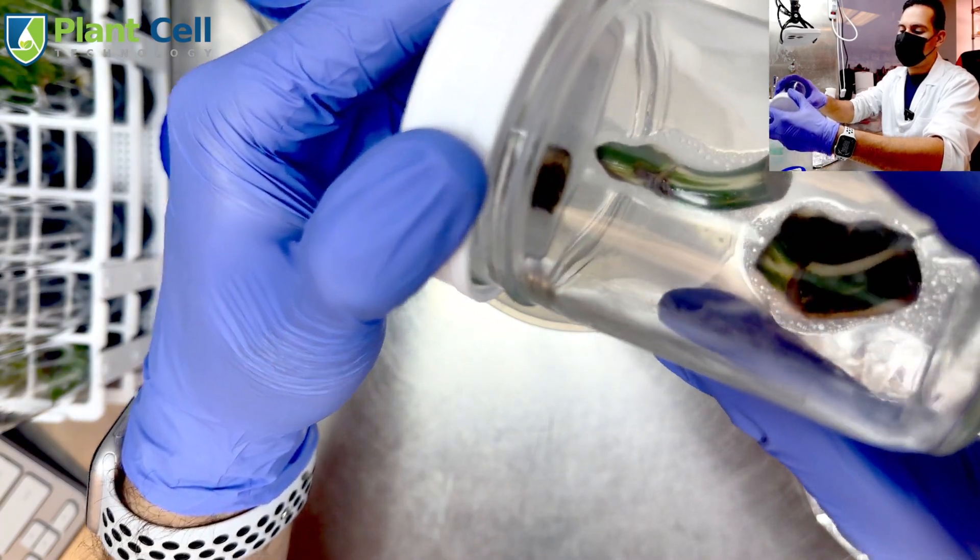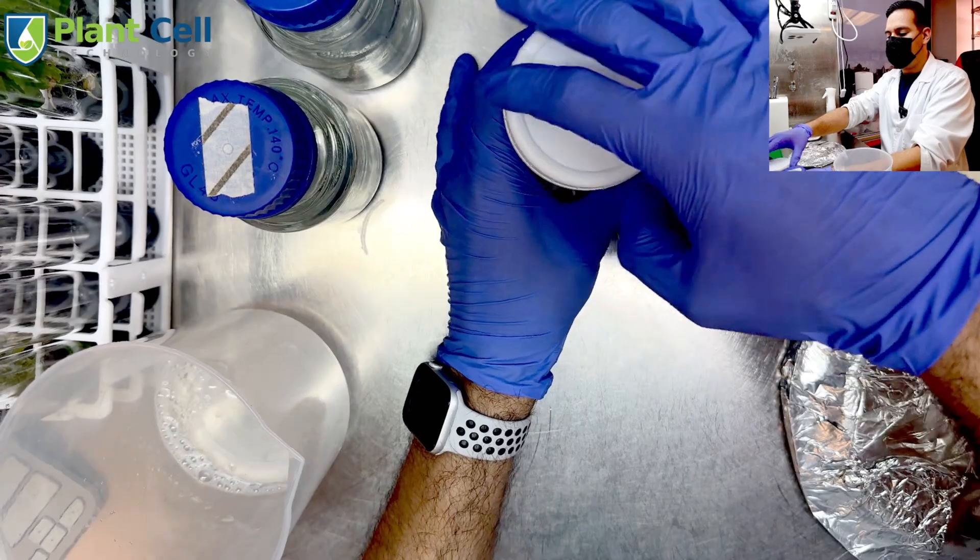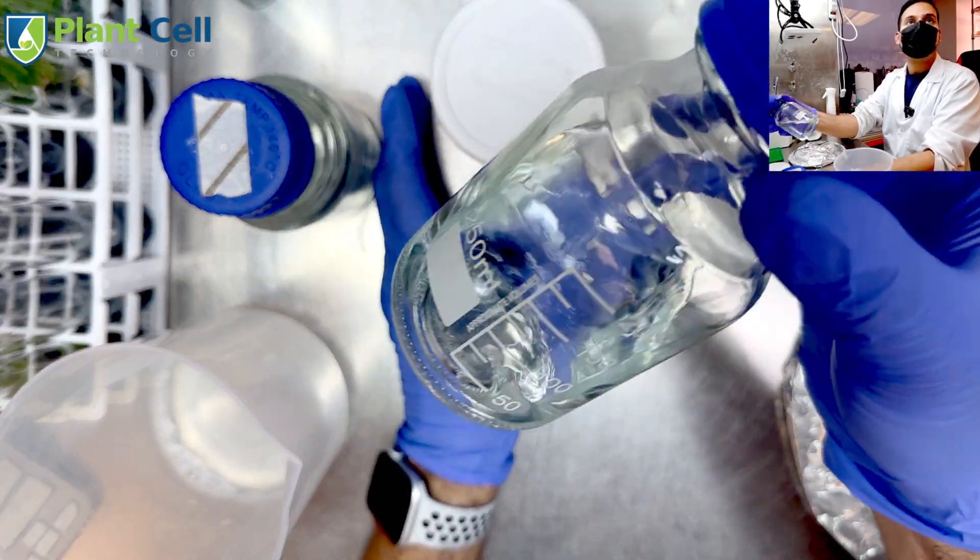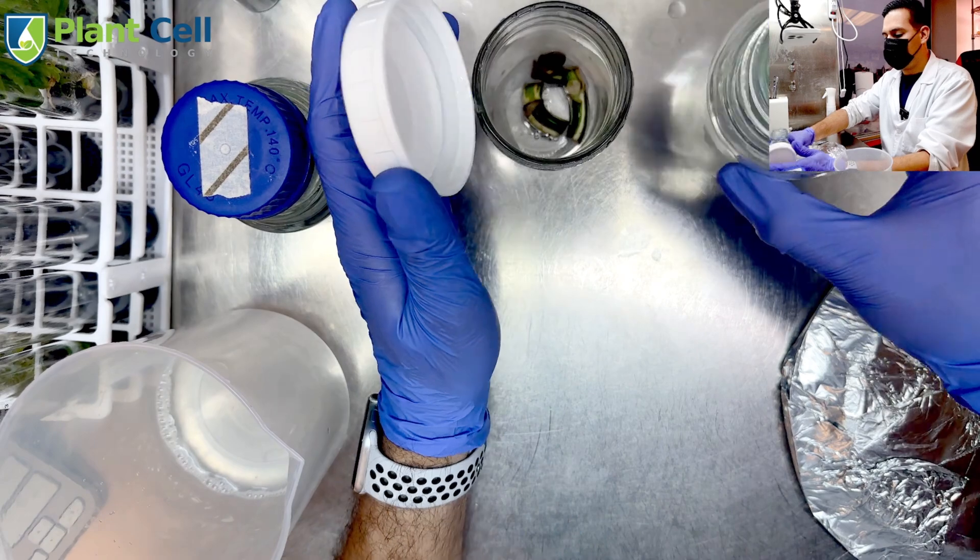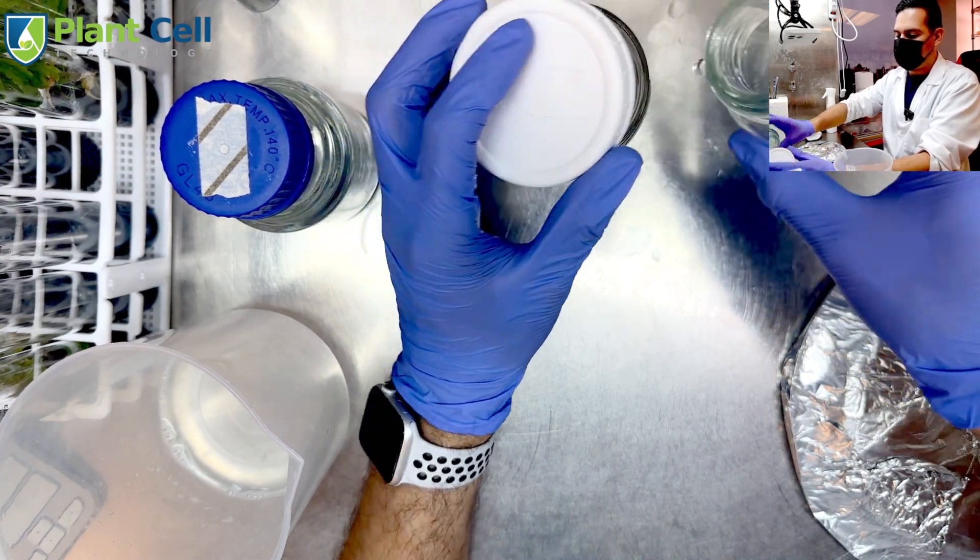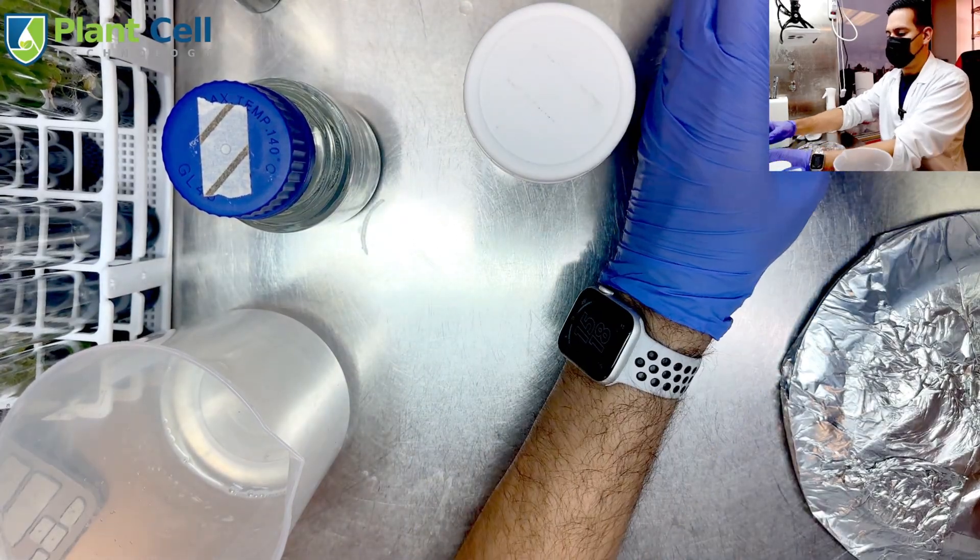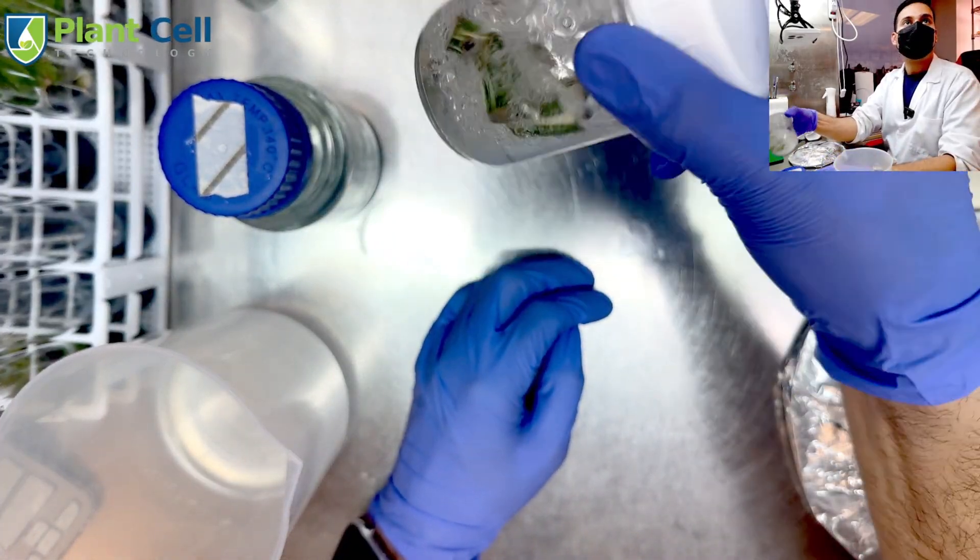Bleach, remove the bleach. Next I take sterile distilled water to rinse the plants, and I want to rinse the plants three times.